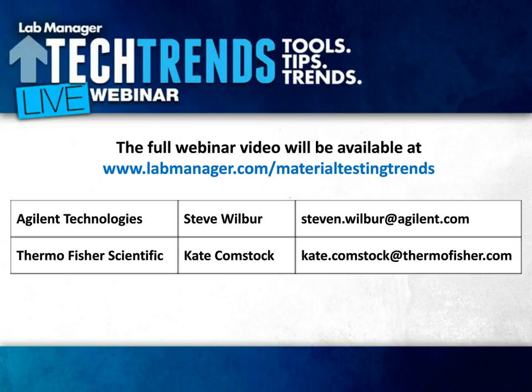Okay, thank you. And Kate, is there a high-resolution GC-MS spectral library that's available? Currently, I don't think so from the Thermo side, but we are working on it, so that will be part of the mzCloud high-resolution database. Yeah, that's a good question too.